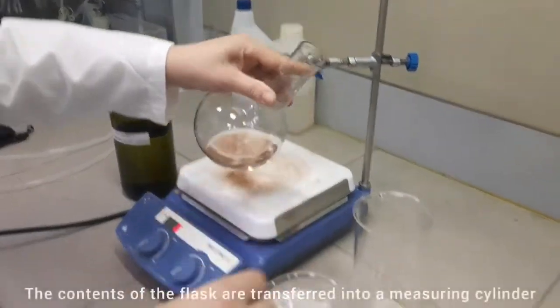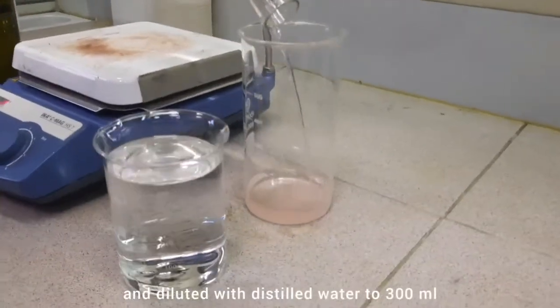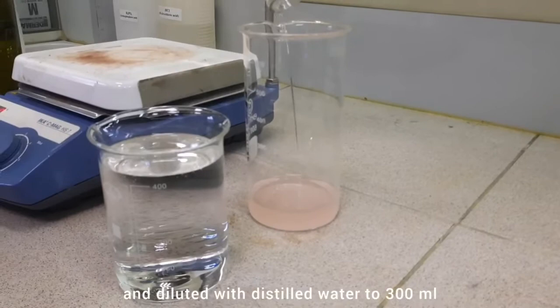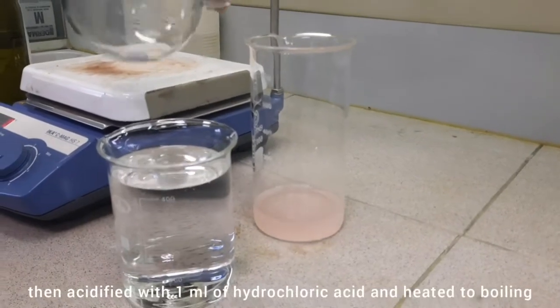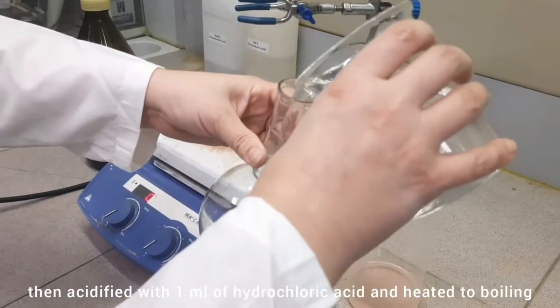The contents of the flask were transferred into a measuring cylinder and diluted with distilled water to 300 ml, then acidified with 1 ml of hydrochloric acid and heated to boiling.